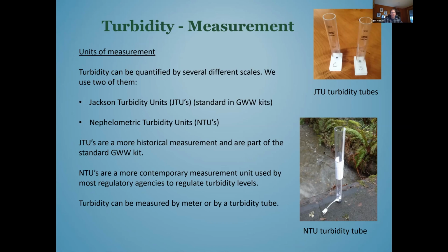You can measure it with either a meter or a turbidity tube. In our case, we use a turbidity tube that gives us a good idea of what the turbidity is. But if you needed a more precise measurement, you might use a meter.